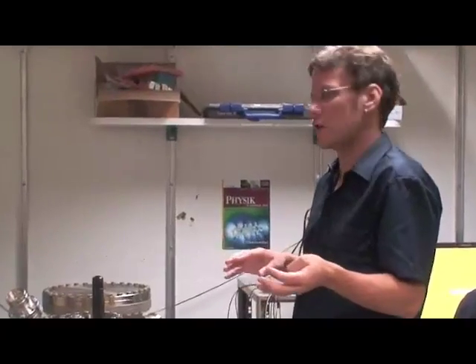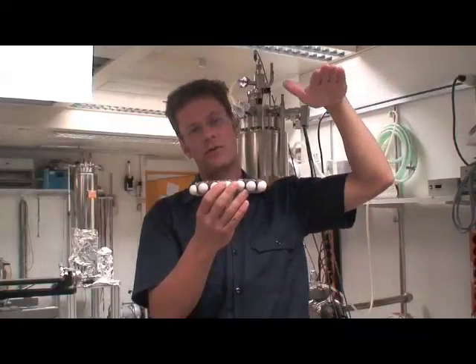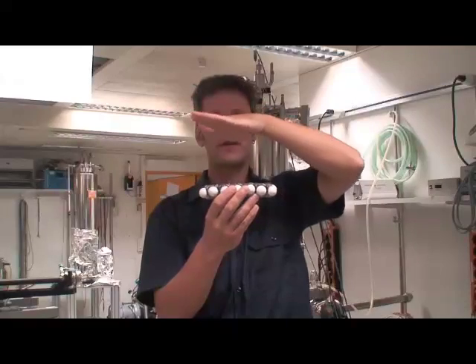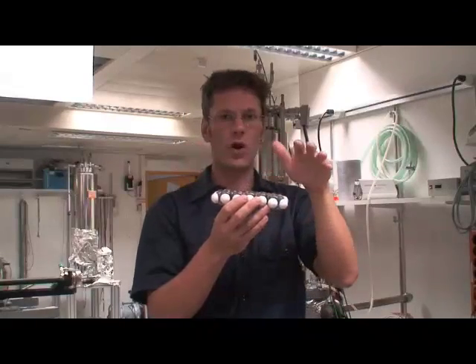IBM scientist Liljeroth explains, "So the calculations helped us to understand what is the origin of the contrast that we observe in the experiment. And I'll try to explain this in brief. First, we image the molecule far away. Then we see attraction by van der Waals forces. And this attractive part has no atomic corrugation. So the whole molecule is just imaged as one blob.